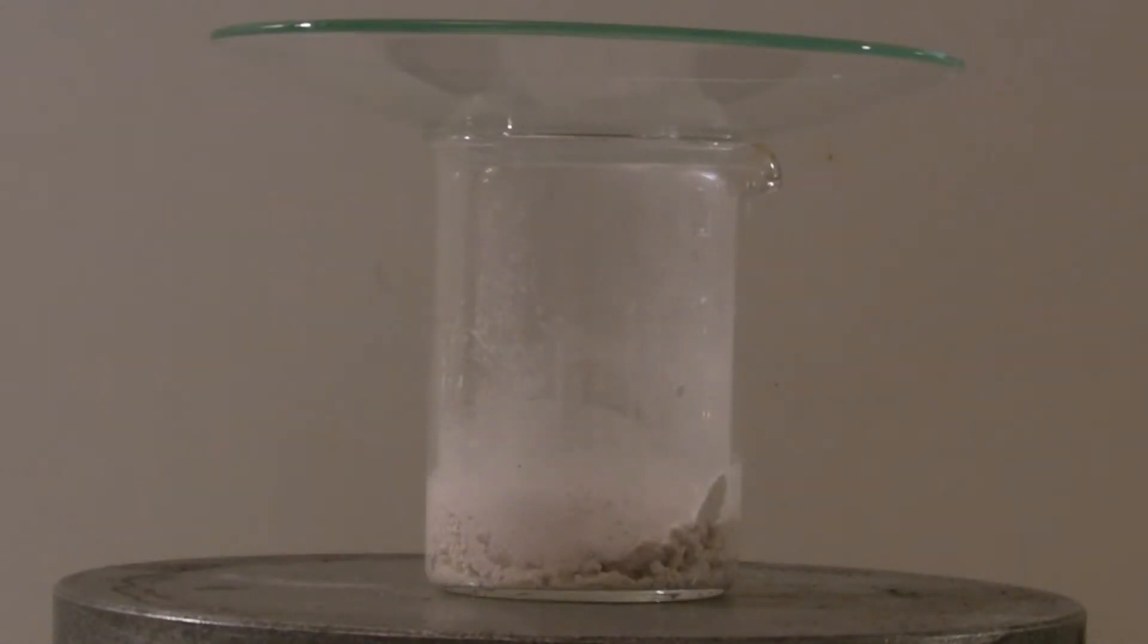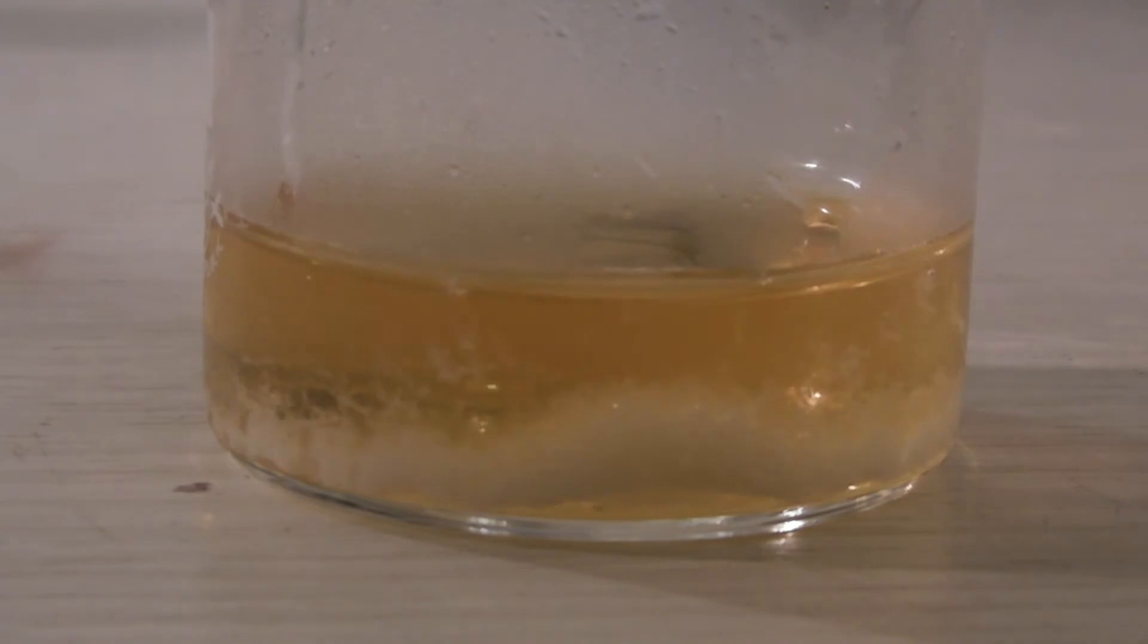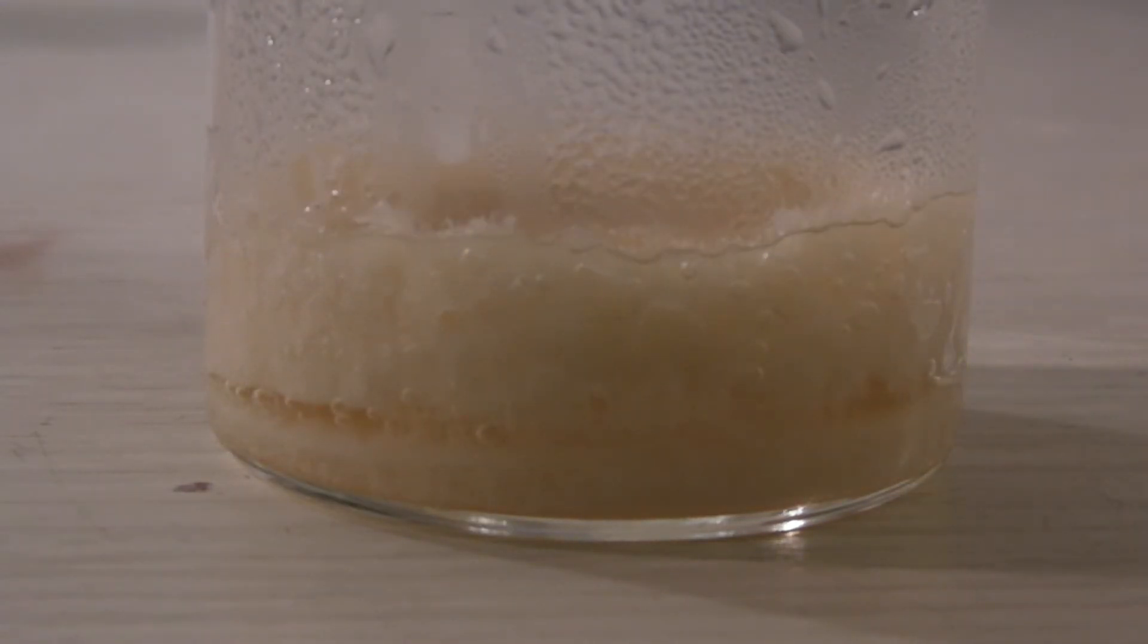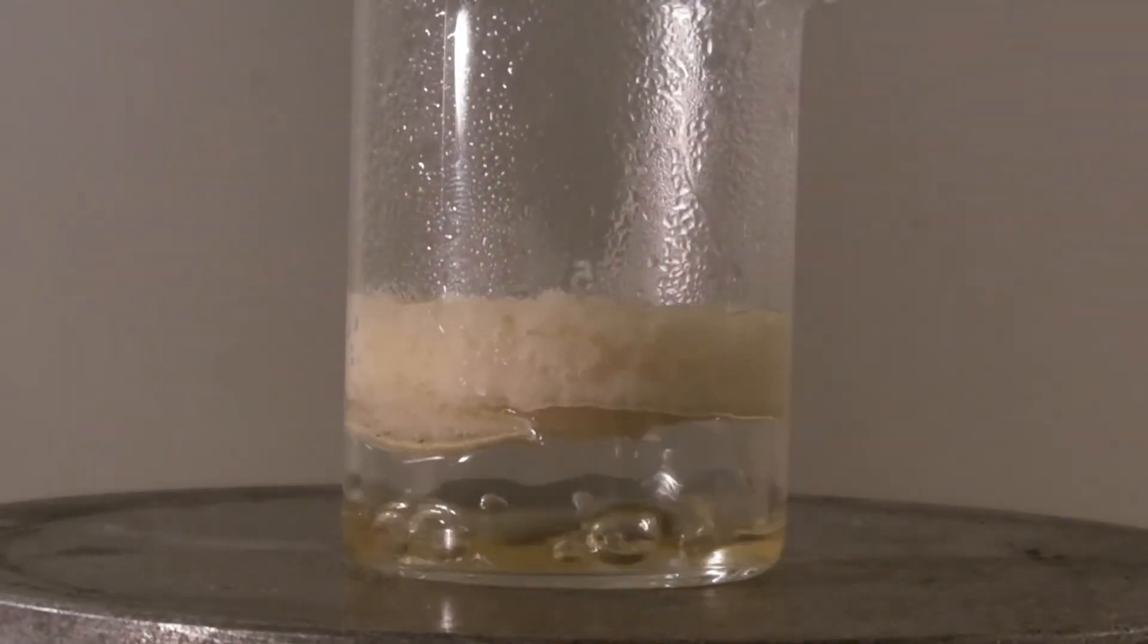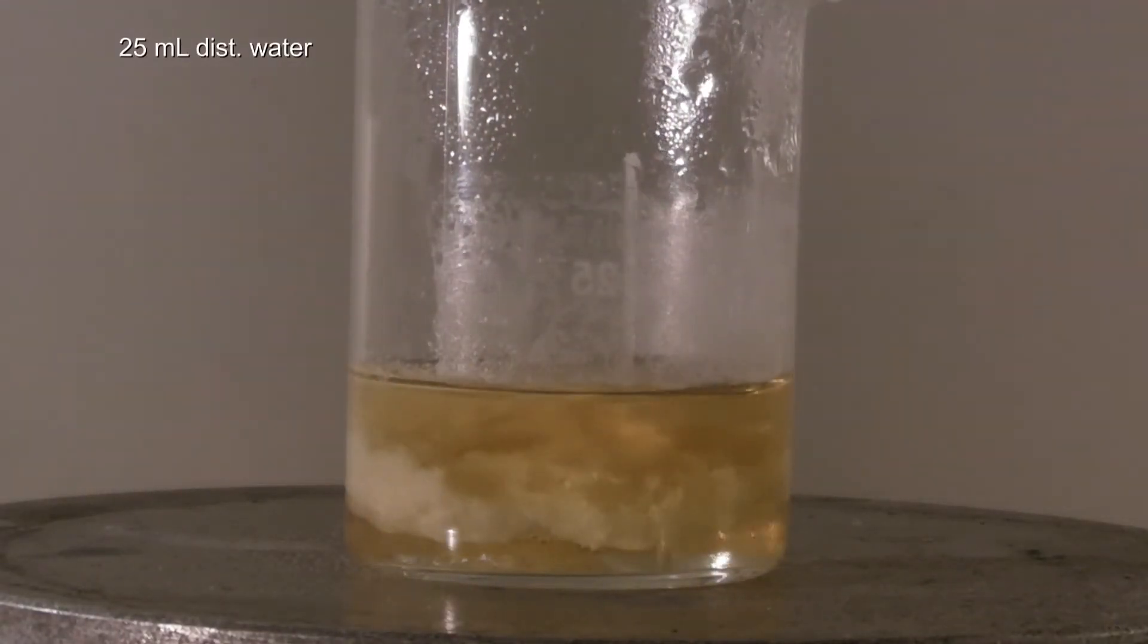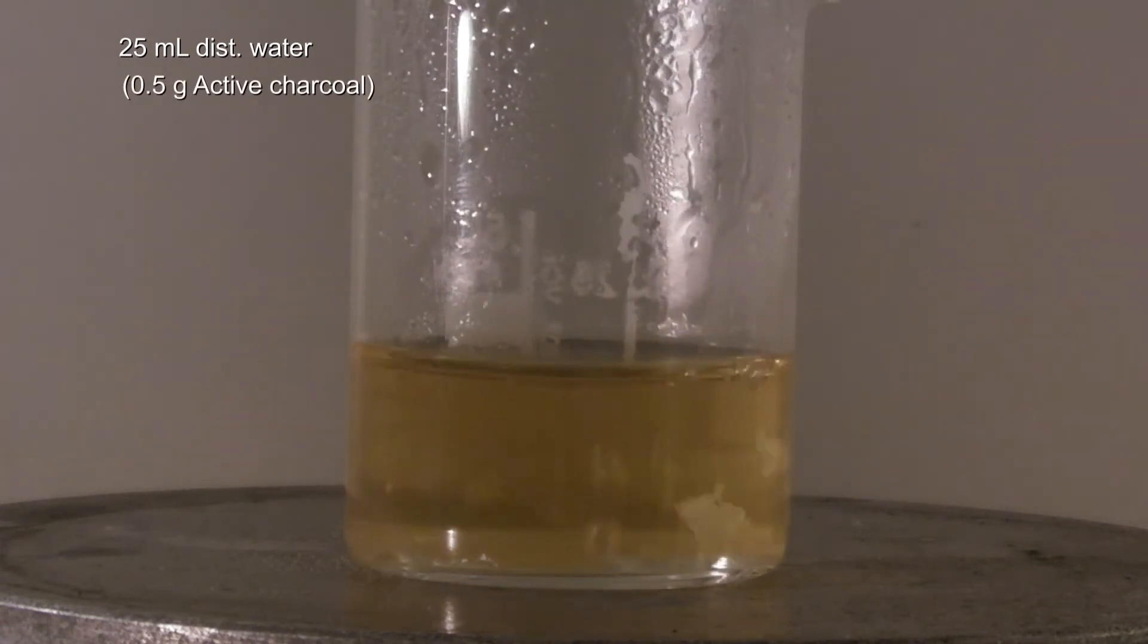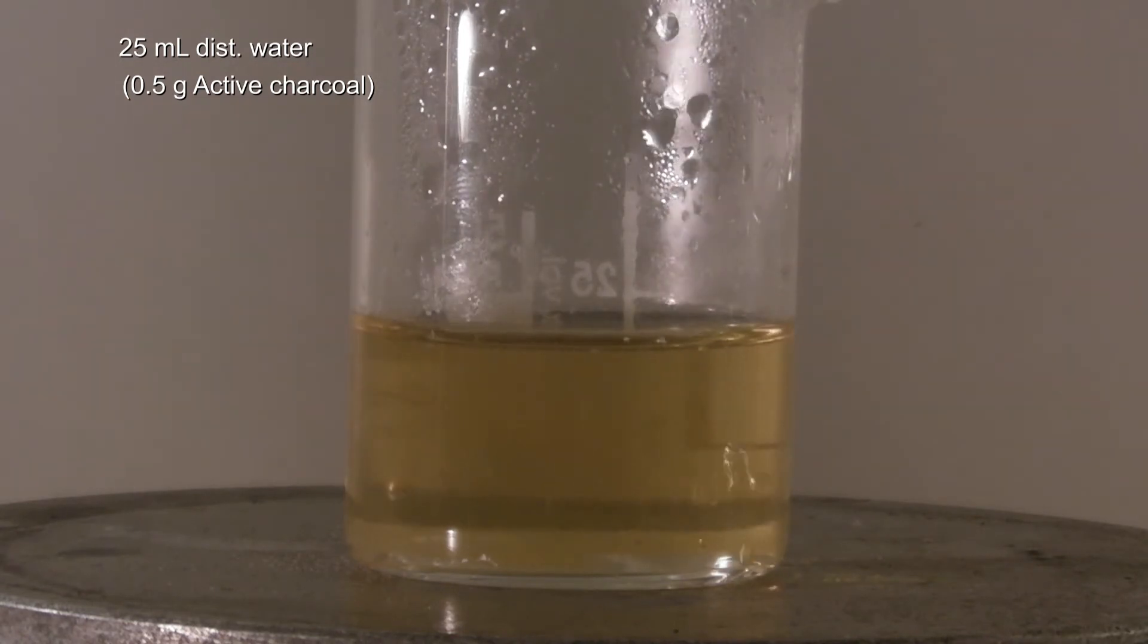At first it was tried to recrystallize from the smallest amount of water as it is common in the lab. But on crystallizing it became obvious that more water should have been added. In the second run, 25 ml of distilled water were added according to the literature. Here 0.5 g of active charcoal could be added and afterwards filtered off from the hot solution to get a cleaner product.